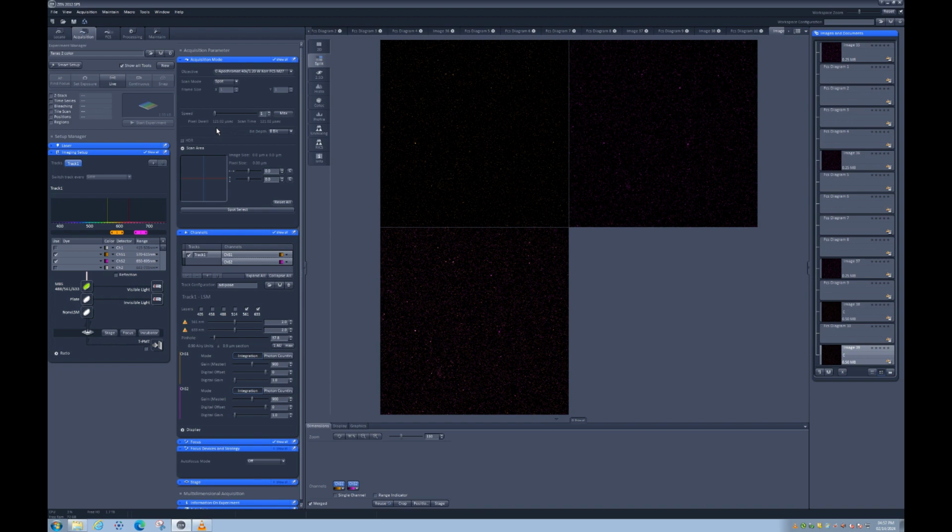We right now are going to collect multiple points, multiple time points within the same spot. And if our pixel dwell time is very low, our data file will become gigantic very fast. And our liposomes are actually kind of big, and they diffuse slowly. So we do not need that big of a time resolution, but we need a lot of time points because we need to image for a minute, for 2 minutes, for a couple of minutes.